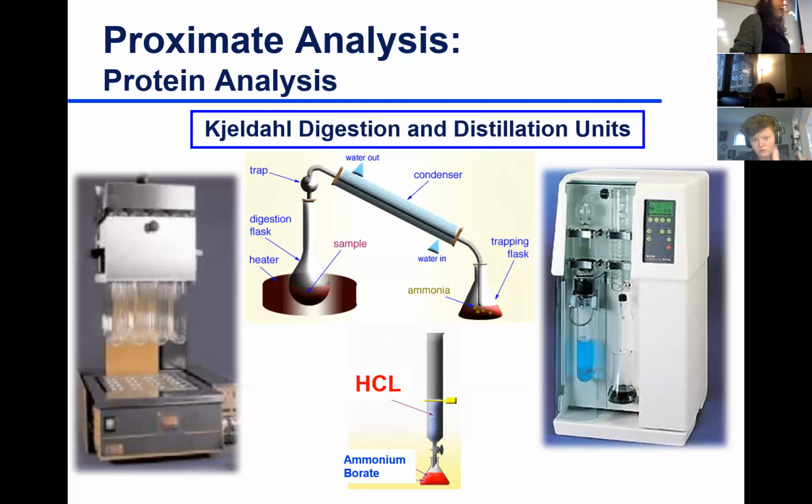So you will have the reaction of ammonium sulfate with NaOH. Here you have heating by steam. We inject steam, it heats the entire tube. Ammonia will evaporate and go out, and some water will also evaporate. That's why we add water also to the mix, so that you have a medium for the ammonia to be with.